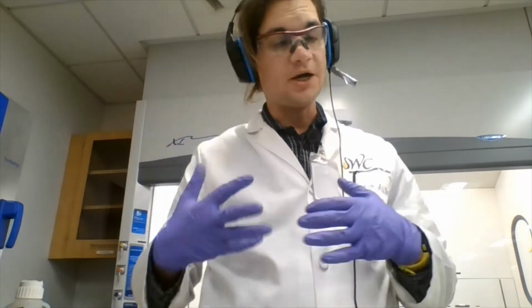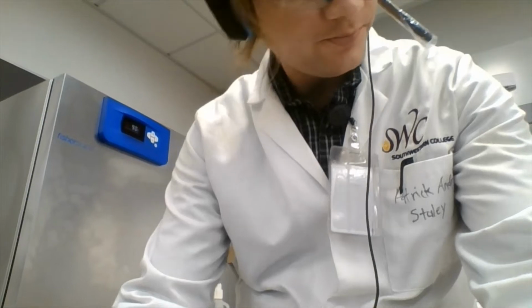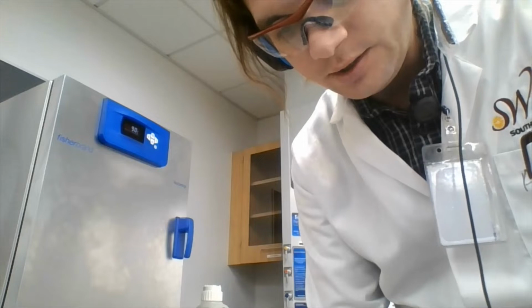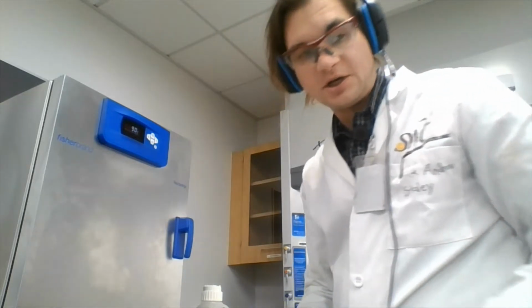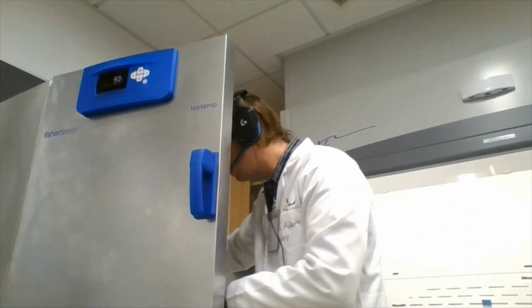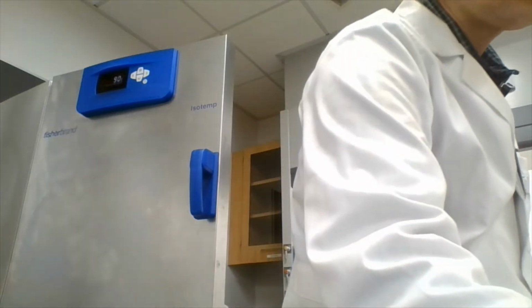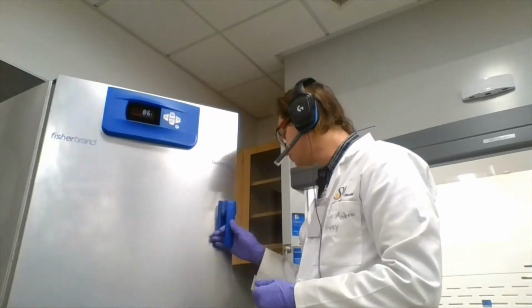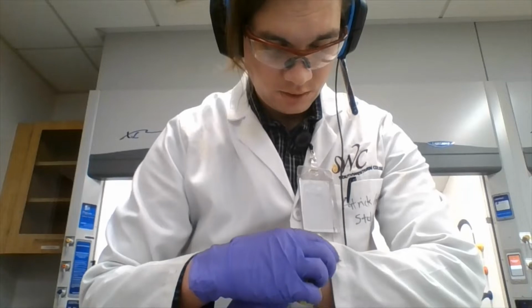Now, we are not done with these because, as I said, we need to know how much water has left. So we need to make sure that all the water has actually left. That's why we reheat it and measure it again. If the masses are the same, then we know that we've actually gotten rid of all the water. But if the mass keeps going down, that means that there's still more water to get rid of. So there's A, and there's B. And we will check back with them in another 30 minutes.